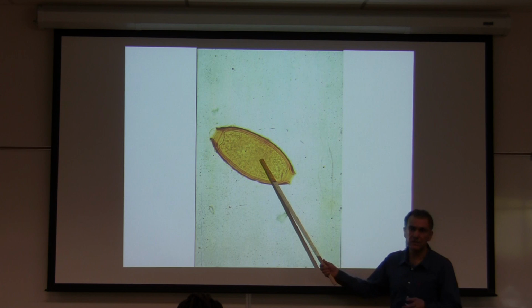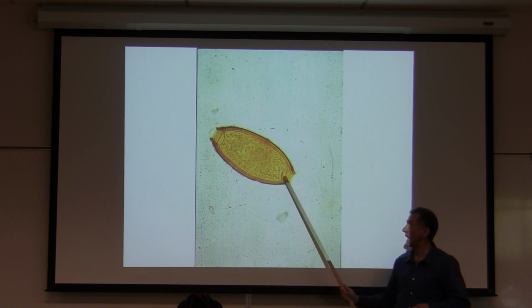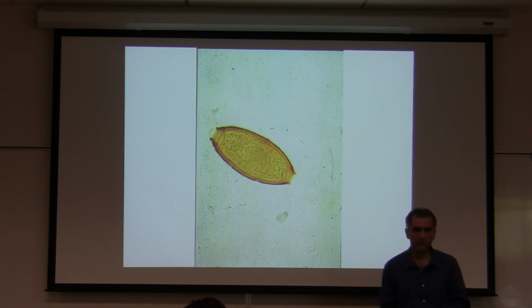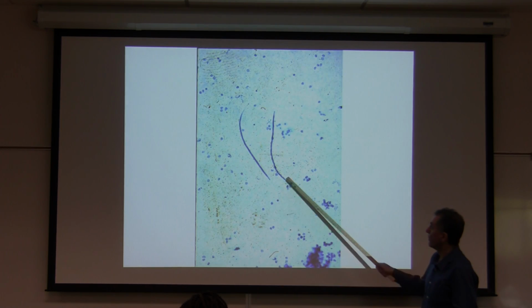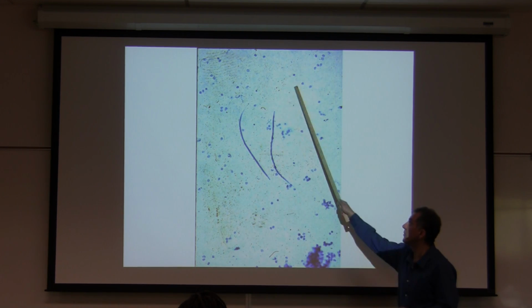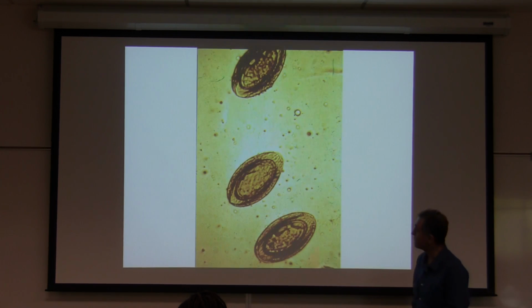Okay, I'm not telling a lie anymore. This is the truth: this is your Trichuris whipworm egg. The other one wasn't, so don't worry about the other one. They do look alike, but they're two different species. What is the name of the organism? Dirofilaria immitis. This is dog blood with Dirofilaria immitis right here. What stage is this? Microfilaria.